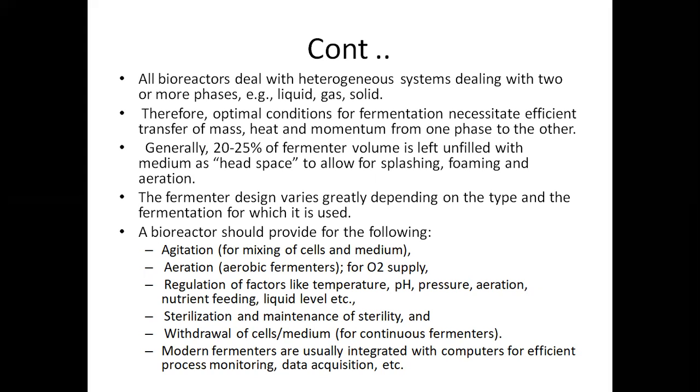So the fermenter design varies greatly depending on the type of fermentation for which we are using it. Again, these are the simple things that a fermenter or bioreactor should have: agitation, aeration systems for oxygen supply, regulation of temperature, pH, pressure, nutrient feeding, liquid levels, etc. There should be provisions for sterilization and withdrawal of cells and medium for continuous fermenters. And the more modern fermenters are usually integrated with computer systems so that we can monitor them efficiently, and we can also have the data when we need it.